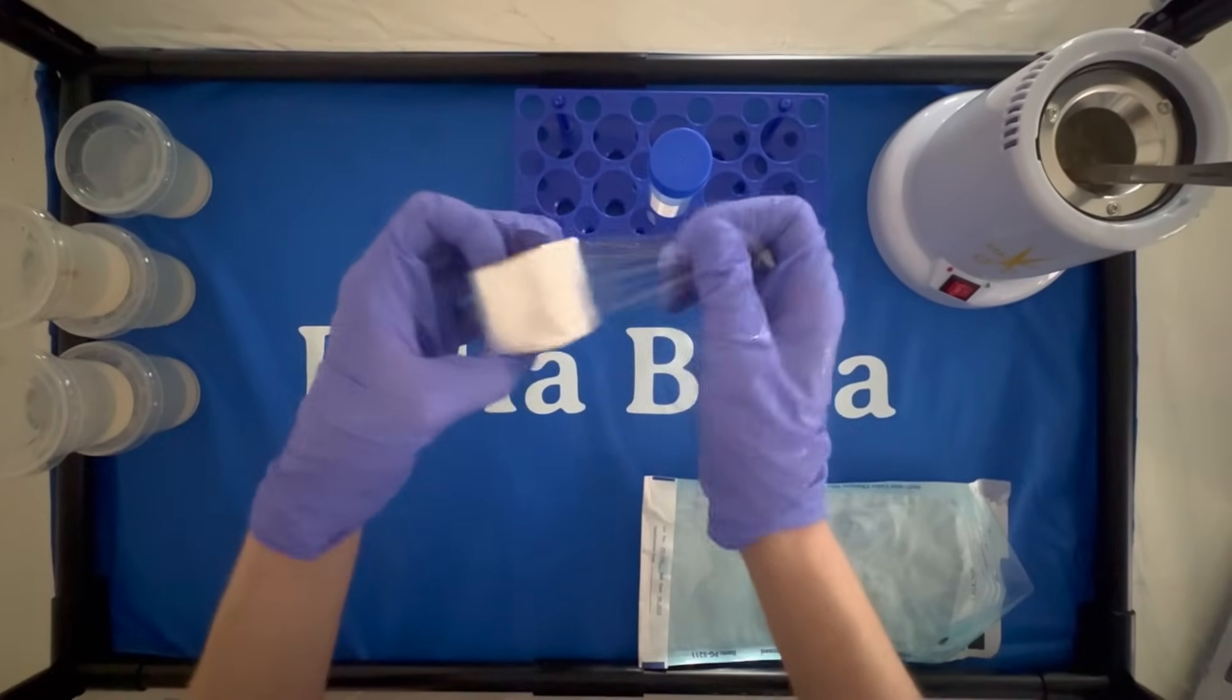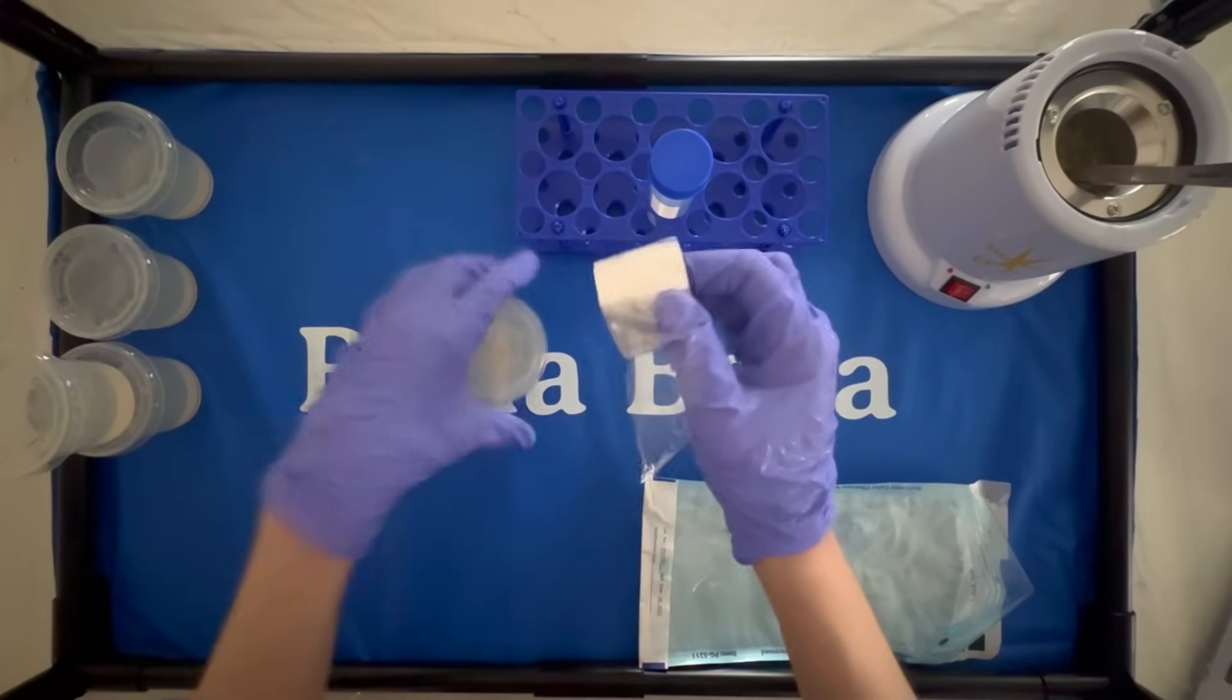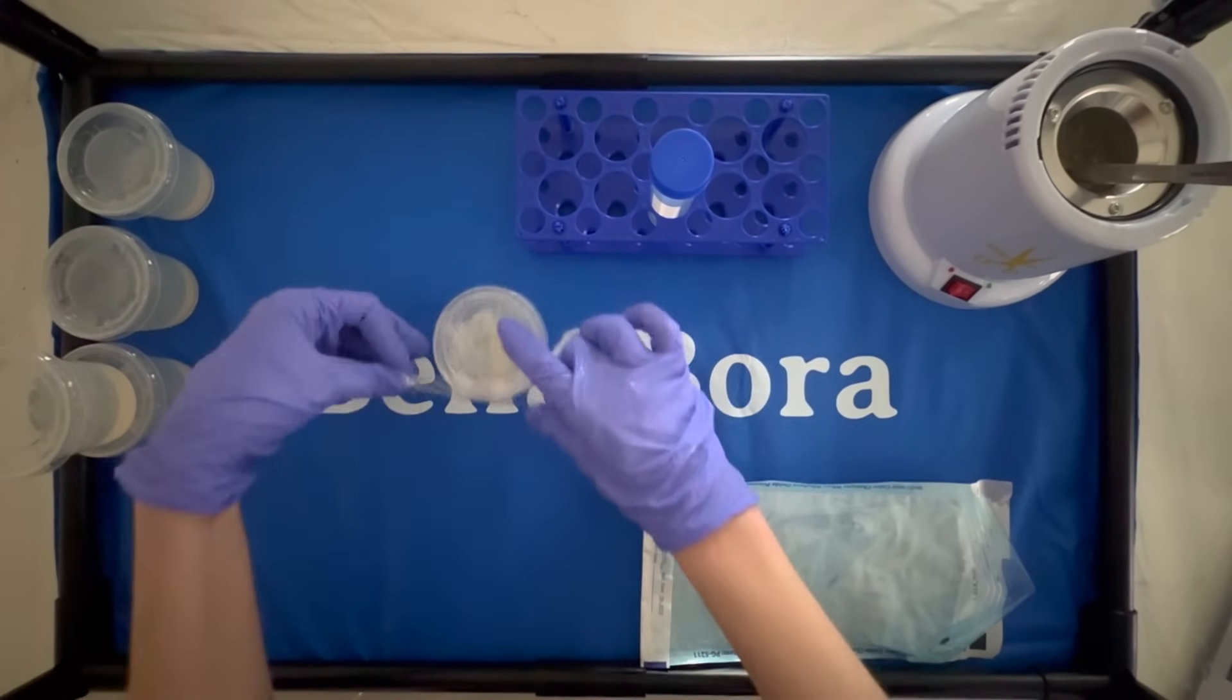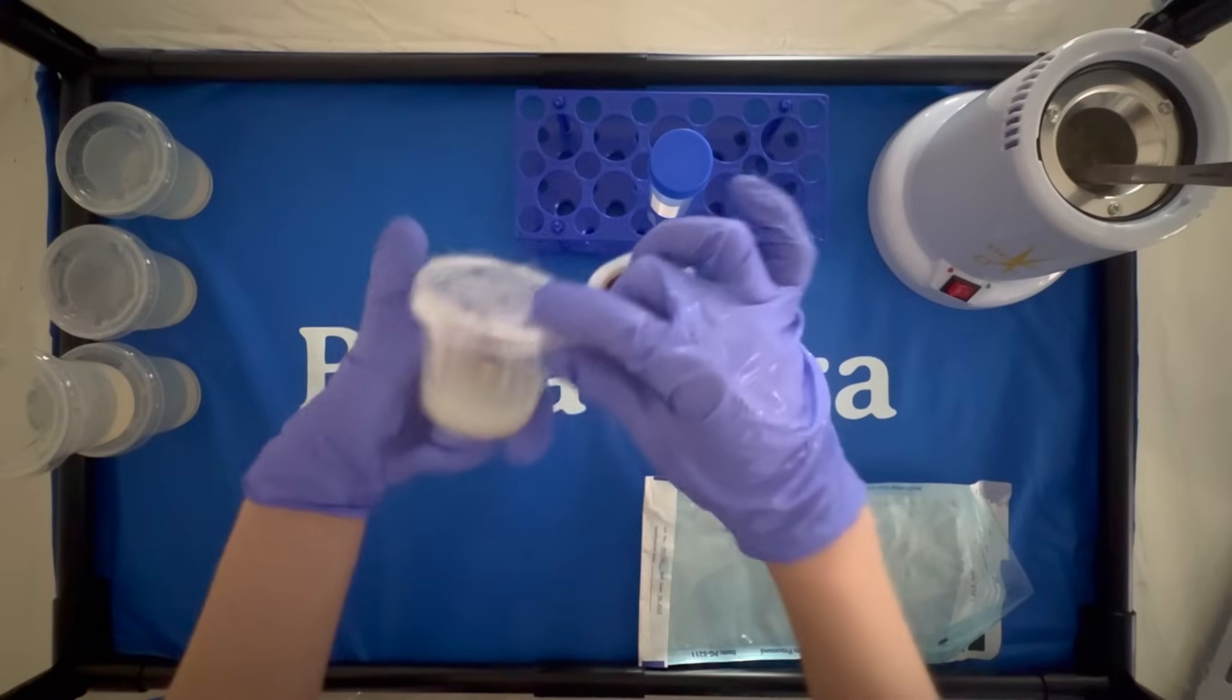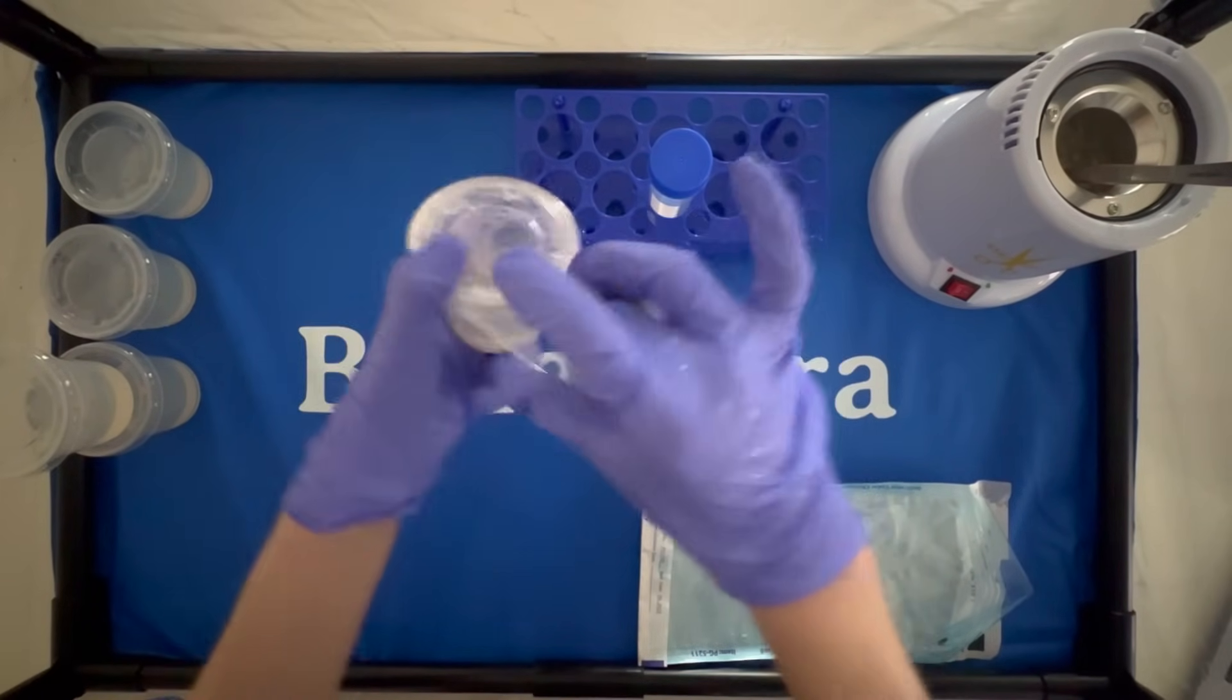Afterwards, I wrap the containers in plastic wrap to help prevent contamination when we take them out of the still air box. And I place the containers underneath some full spectrum grow lights and we're good to go.